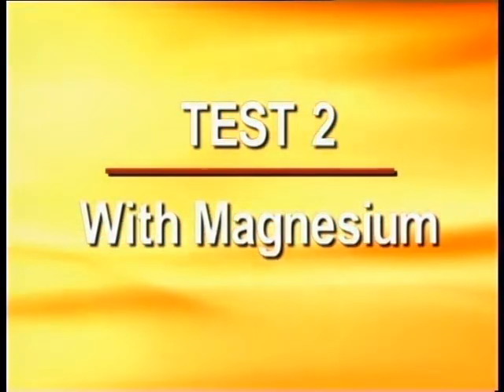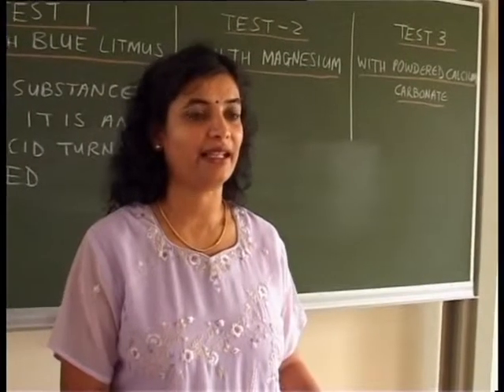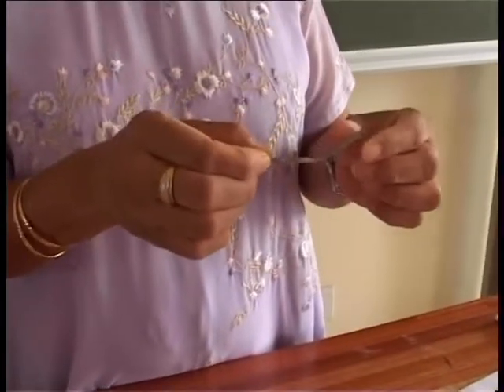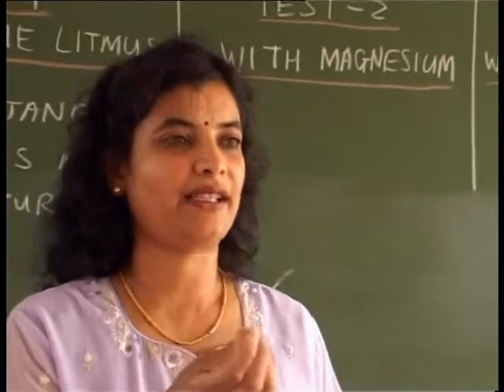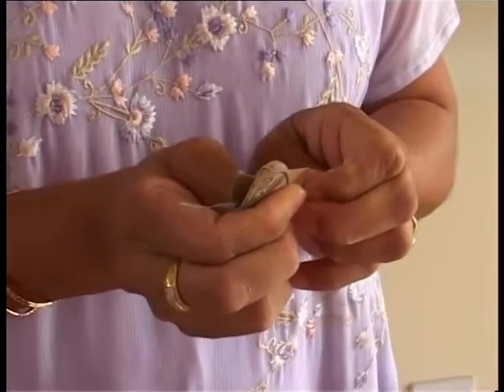Acids react with some metals, and magnesium, we know from grade 9, is a very reactive metal. It is this gray-white metal piece. Do we all know what is the gray-white covering on magnesium? Magnesium that reacts with oxygen in the atmosphere. Sandpaper. The teacher explains that the magnesium oxide must be removed using sandpaper.